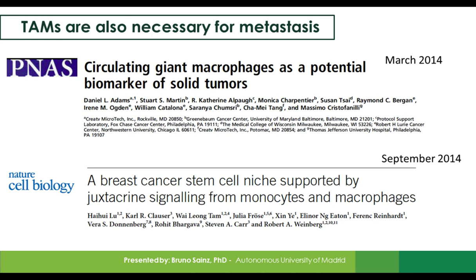So regarding previous point number 4, where I mentioned that the elimination of immune cells from the sample may compromise our ability to detect circulating tumor cells or circulating cancer stem cells, as more studies are indicating that these types of circulating cells actually exist in circulation as aggregates with immune cells, what we've tried to do is take information from the literature and apply this to our platform.